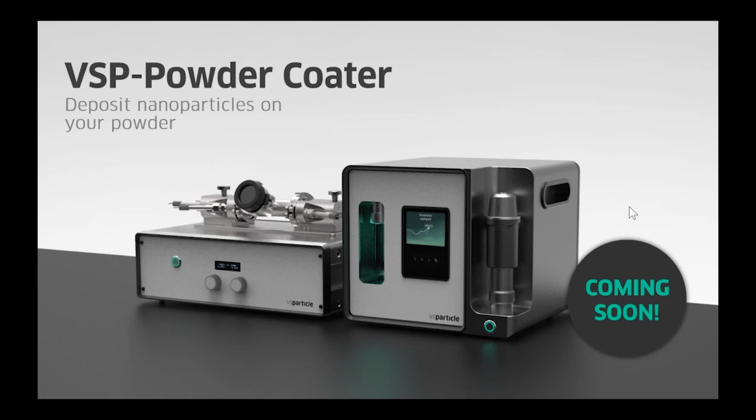First question comes from GT. The deposition method shown in this presentation works fine for 2D systems, films, filters, etc. Is there any way to transfer the nanoparticles in a porous support?